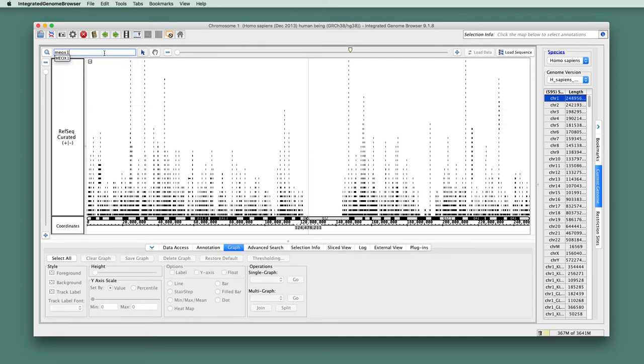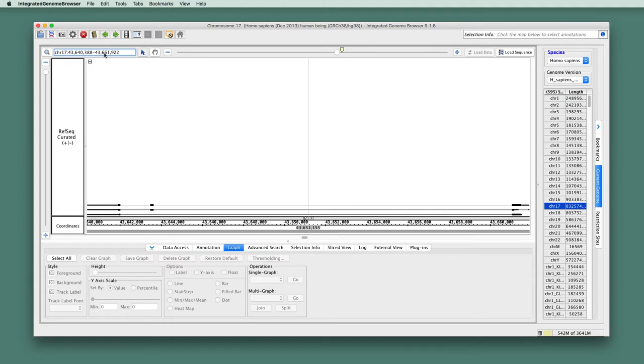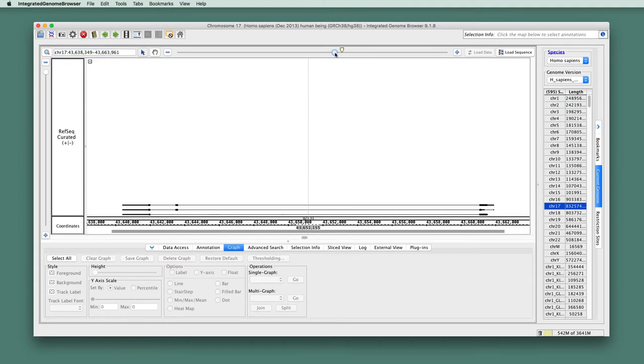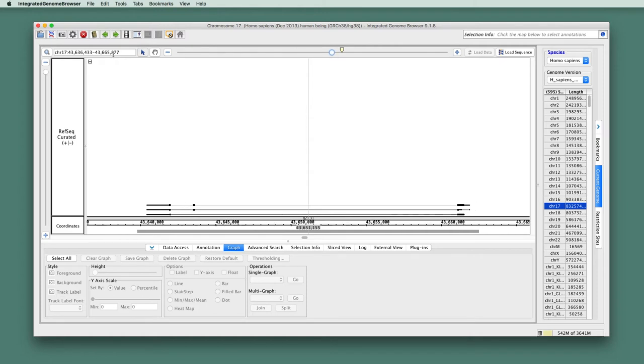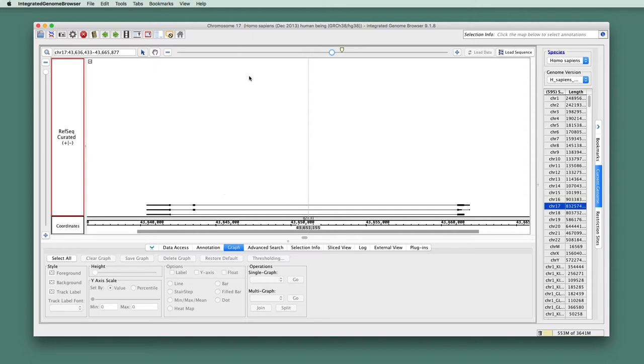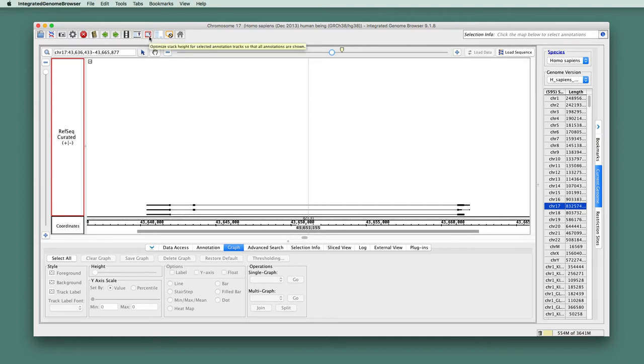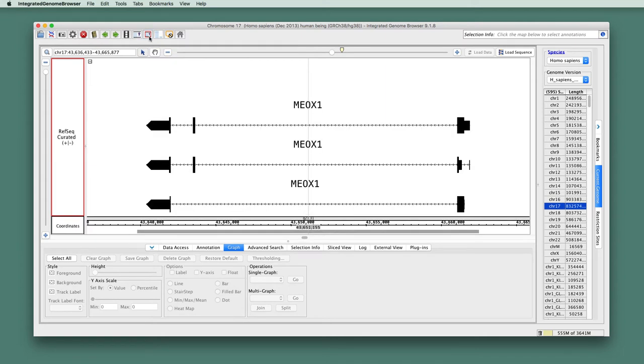That has an interesting splicing pattern. Let's zoom out a little bit. And the gene models are kind of scrunched down by the sequence axis. Let's give them, let's have them take over most of the vertical dimensions. So I select the track, and then I choose a shortcut that optimizes the stack height so that all the annotations are visible and taking up the maximum amount of room.